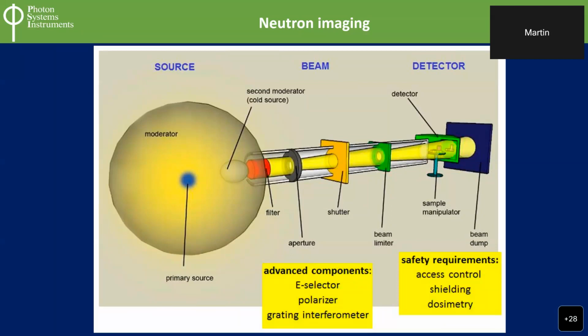What we are doing now, we did a lot of experiments in Prague, where they have three nuclear stations, so three reactors, of different power. But our main interest was to use just a regular source, some material which is radioactive, but on the other hand is generating neutrons. So you may have this small source of neutrons, and then you can use it in the lab. And we were developing, together with a British company, the detector for that application.